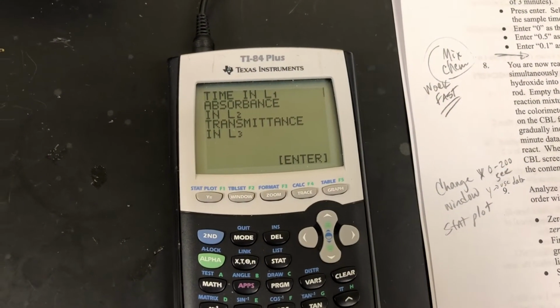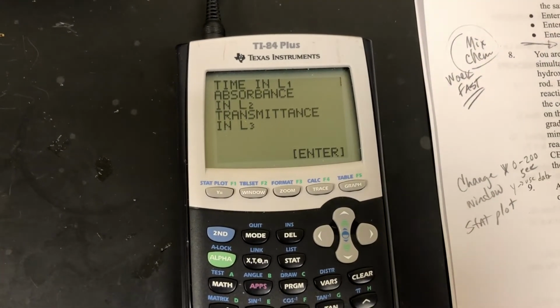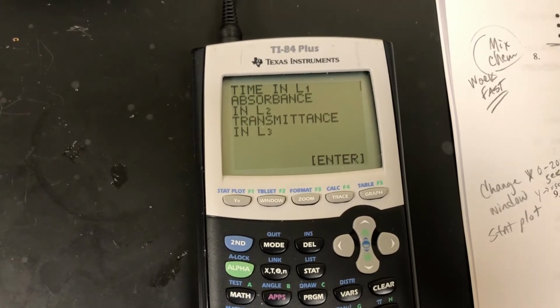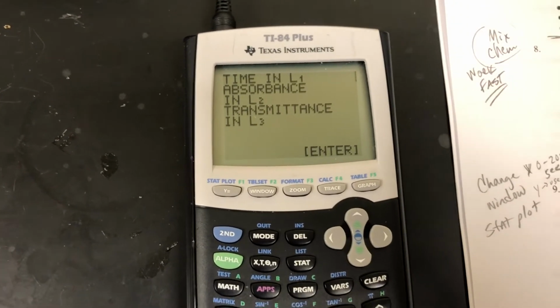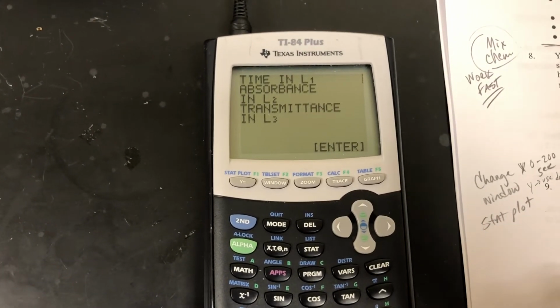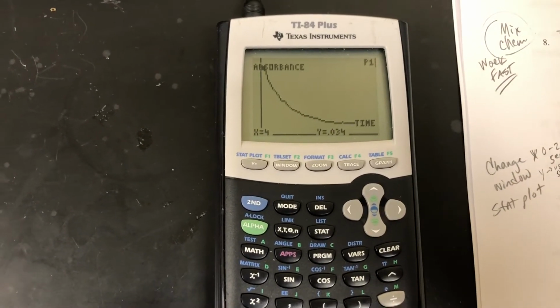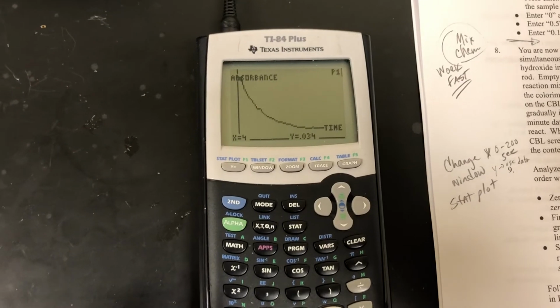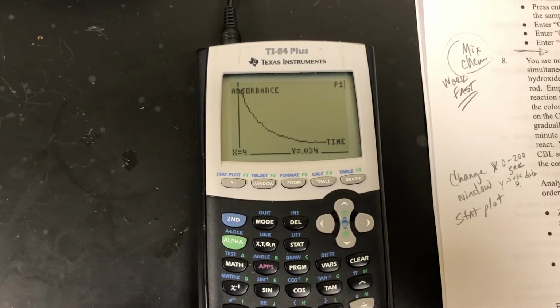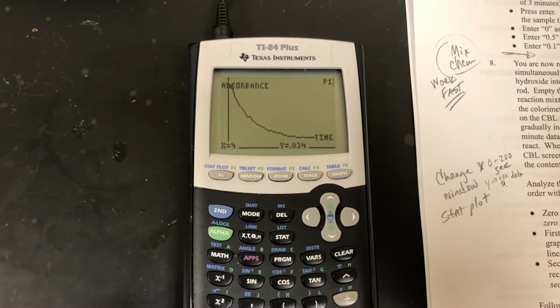Okay. All right, now that the 3 minutes is complete, this is what your calculator will look like. So what it's letting you know is the time values that it collected, which is the sampling every 4 seconds, is in L1, absorbance is in L2, and transmittance is in L3. So if we hit enter, there's a graph of our absorbance versus time graph. And since absorbance is directly proportional to concentration, if it was a 0th order reaction, then the absorbance versus time graph would be linear, which it's not. So that immediately lets us know that this reaction can't be 0th order.